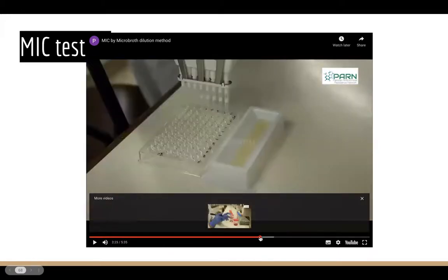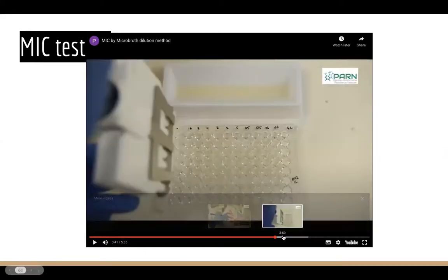So the technique, a lot of the time I use agar dishes for this, because these do fit with agar dishes, and within 20 to 30 centimeters of your Bunsen burner, or in the microflow hood, you can do this. You can put your media there ready, and you can also take the antibiotic that you've prepared and put that in the plate ready as well. So you can just pull it with your multi-channel pipette here, and then you can just go along, and then when you're ready, you can read the results.